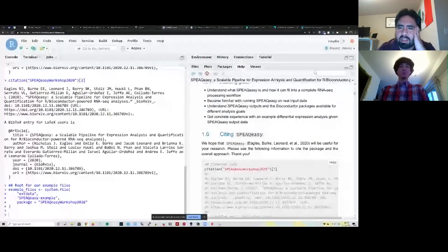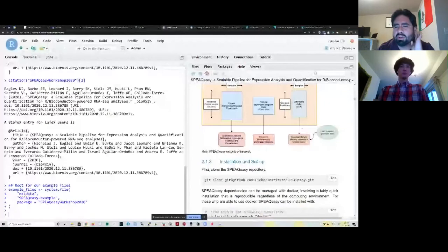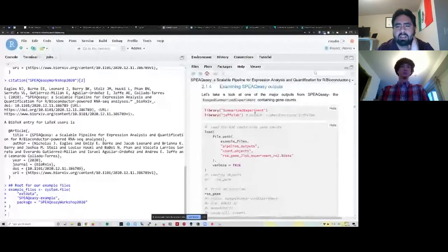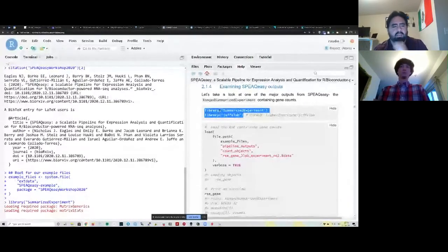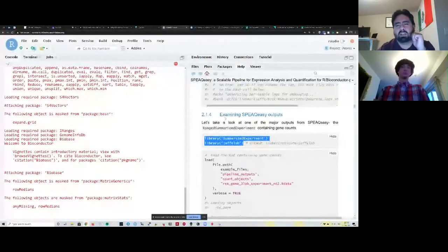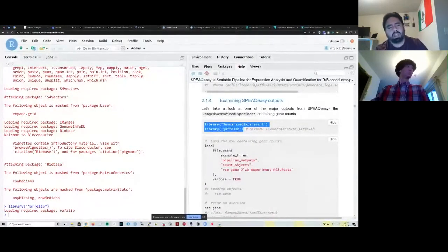On the right, I only have this HTML window with a vignette. I'm going to do this because it's going to make it easier for us to select some lines of code, for example, here, and then press Ctrl-Enter to run the code on the console. So this is if you want to run the code yourself live, but you can otherwise just follow on the vignette.